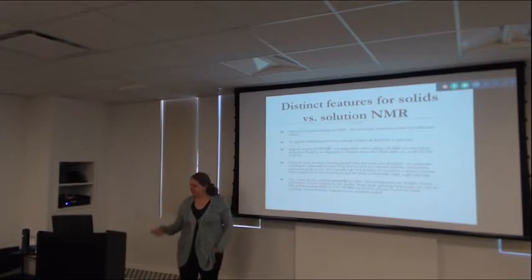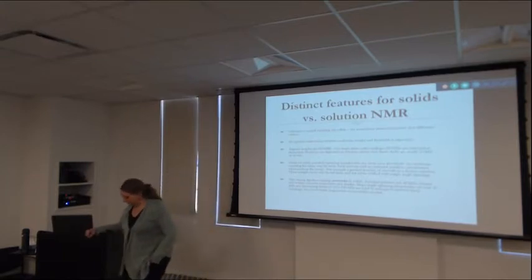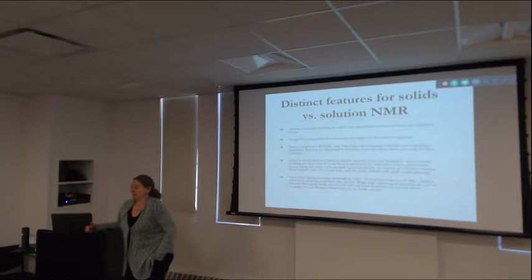So the whole behavior will probably be qualitatively different. I mean, we know for a fact that it's qualitatively different. And if sometimes our goal for solids NMR is just to get rid of that whole network of dipole couplings so we can study something else, so we can get control of the magnetization in a pulse sequence, what does it take to get rid of a network of 30 kilohertz couplings? Well, people are trying to figure that out in terms of magic angle spinning, asking questions like, is 60 kilohertz spinning enough? 60 kilohertz and you're down to a rotor that contains about a microliter.